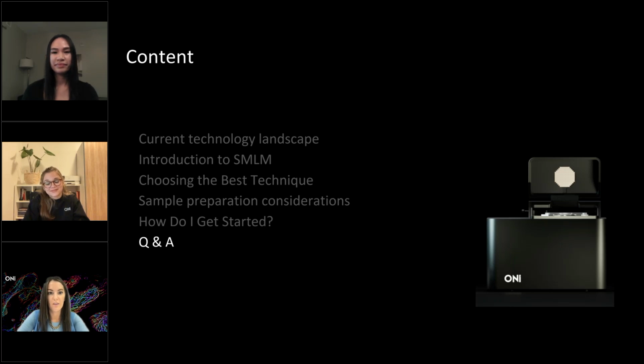Wonderful. All right, so we have Suzanne who asked, is it possible to track viruses of 25 nanometers in size with 5 FPs on its surface? You can track viruses, yes. You can do PALM single particle tracking.